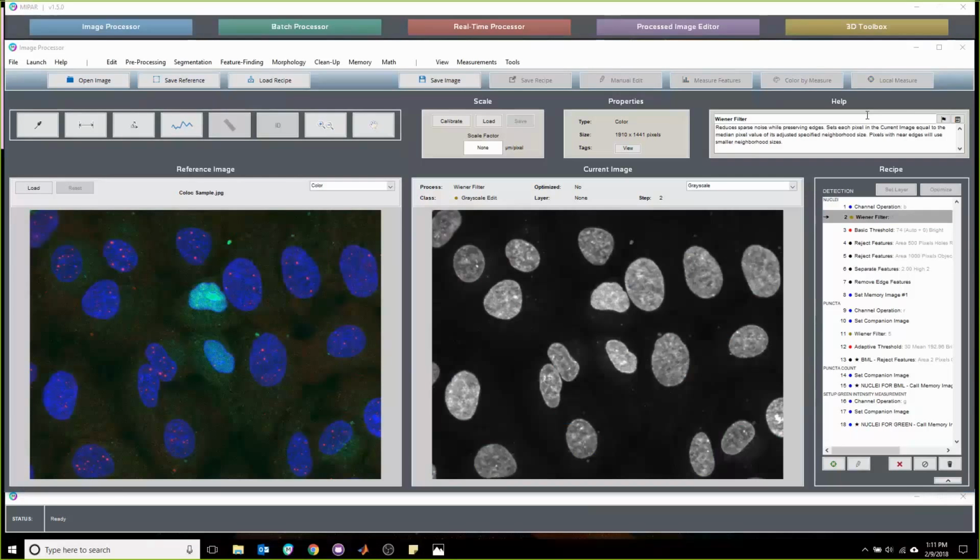Are there any more questions, John, did you see? I did not see any more questions come in on the life sciences section. We got a question on 3D reconstruction for porosity analysis and whether that can be demonstrated. Let me give that some brief thought while we have a couple more come in on the life sciences side.